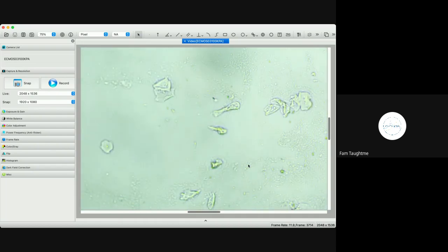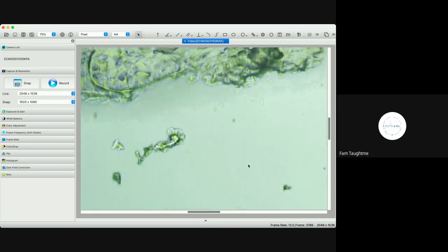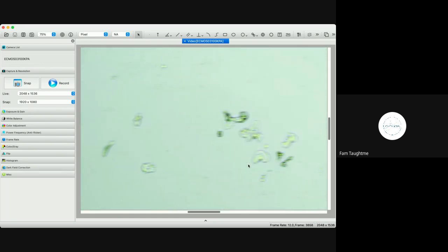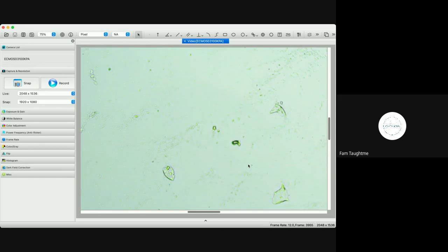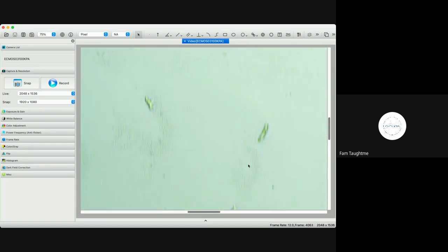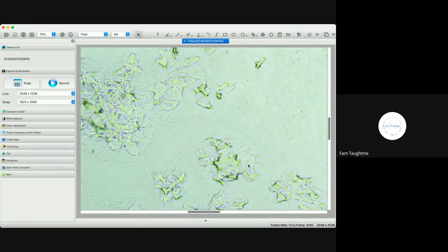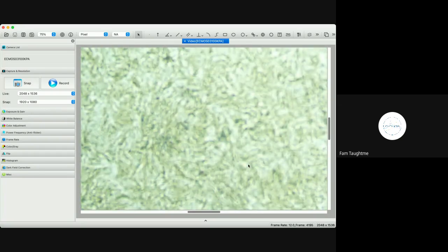Wow, yeah, so this slide is really dominated by a lot of the mucin, somewhat empty in terms of the ferning. On the days when I would see ferns, there would be a lot of them throughout the whole sample. You'd just be scrolling along and then you'd see a bunch of them. So it's interesting that I don't see much here. More big pieces. Interesting. Let's go over this way. Sorry, we got some air bubbles in here.